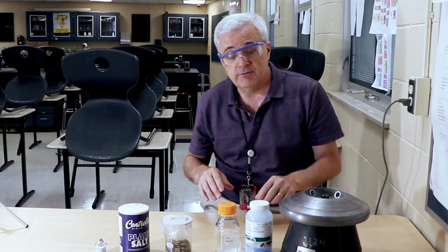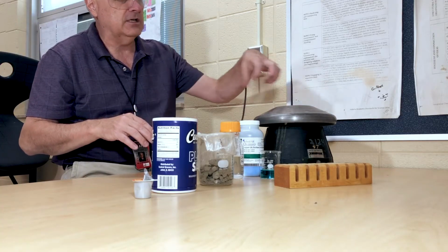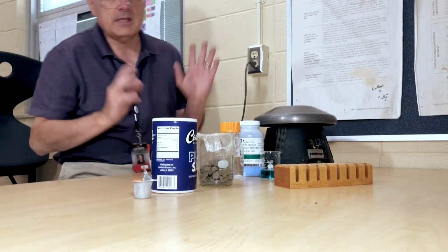We're going to turn the centrifuge on. Be very careful when you're using a centrifuge not to get caught in spinning parts, and that would be bad. Don't do that. All right, we're going to turn this on. If you are doing this as an in-class activity, that is the setup. We're going to turn it on, and then after this spins, you'll turn it off, and then you'll get your own results. So when we get to the results section of this experiment, there'll be a slide in the video telling you to go do your own results and don't watch. So you just turn it on and let it spin.